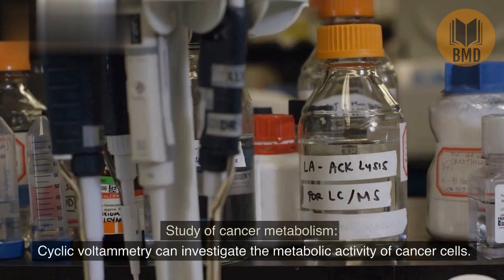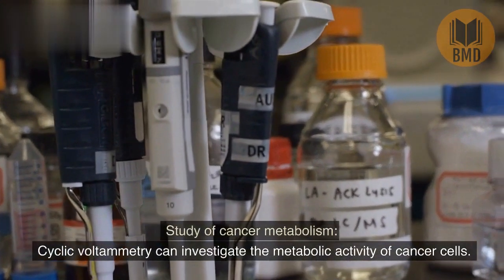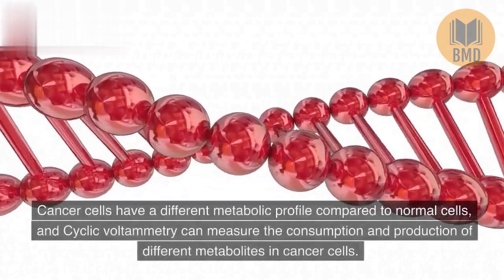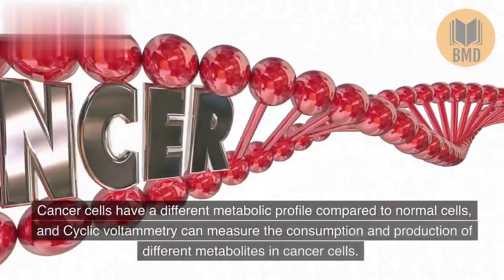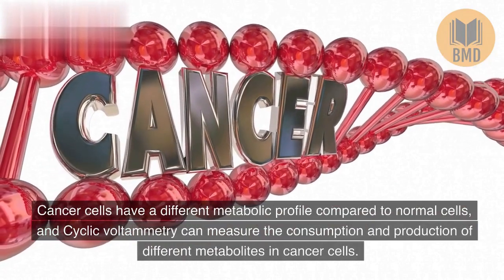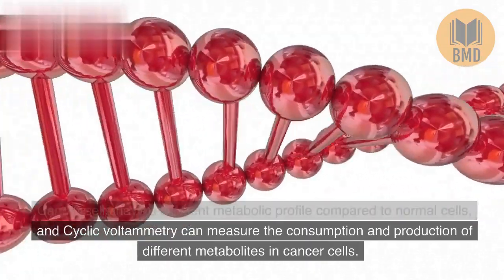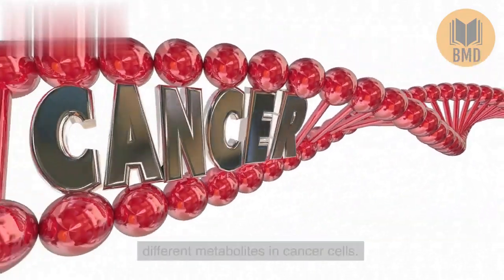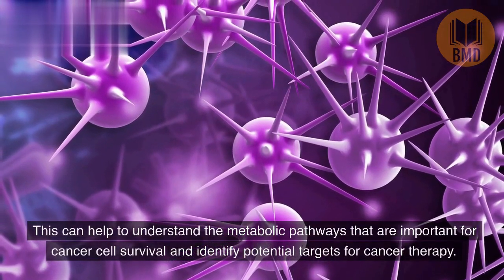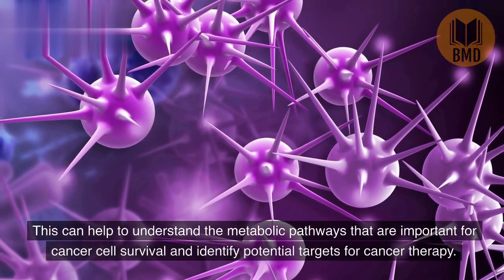Study of cancer metabolism. Cyclic voltammetry can investigate the metabolic activity of cancer cells. Cancer cells have a different metabolic profile compared to normal cells, and cyclic voltammetry can measure the consumption and production of different metabolites in cancer cells. This can help to understand the metabolic pathways that are important for cancer cell survival and identify potential targets for cancer therapy.